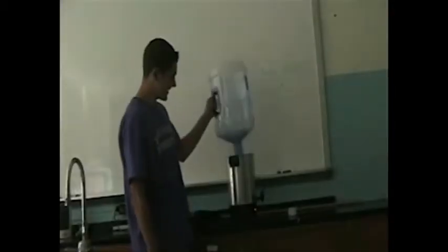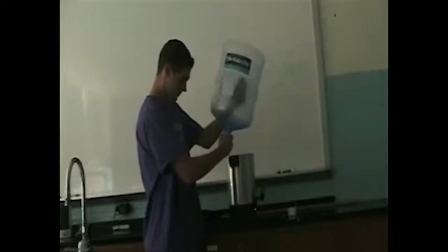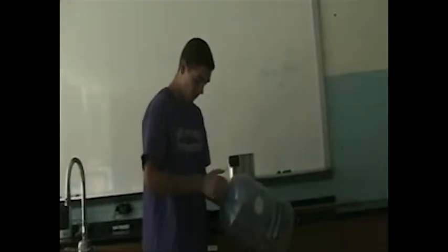After 5 minutes, it's all hot and it can be molded with our hands. Just shake off the water, and mold it into a circle. And then put the cap on so it'll stay that shape. You have to really push it. You might want to put it on the ground and just use some force. You have to wait for a click. Alright, that's good. There you go.